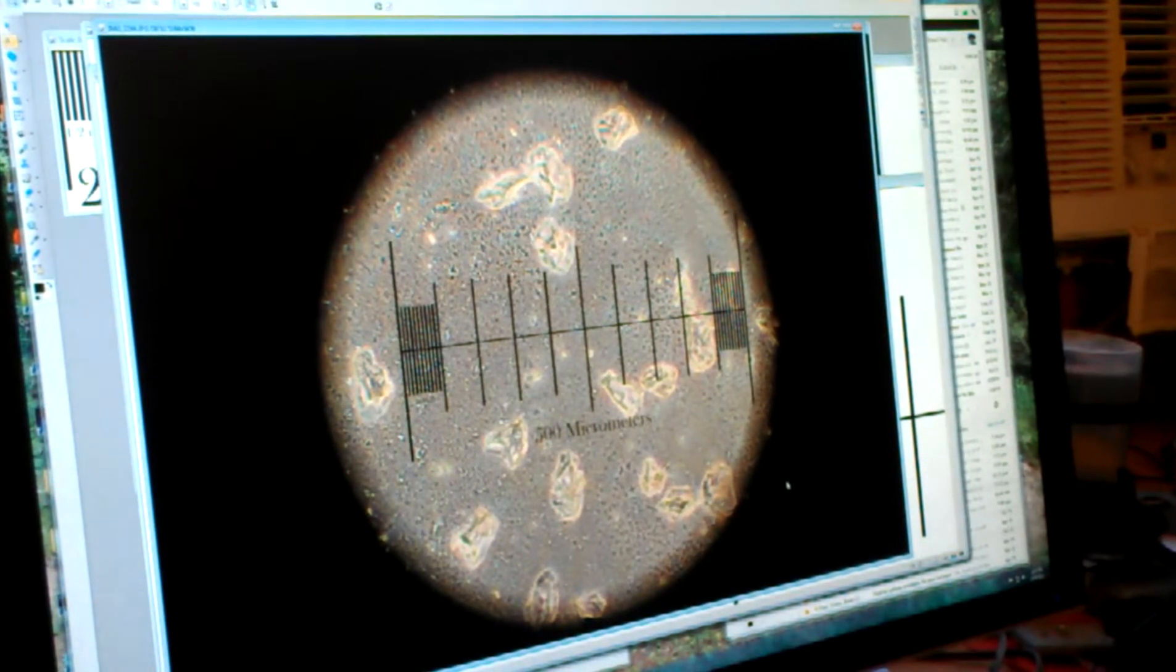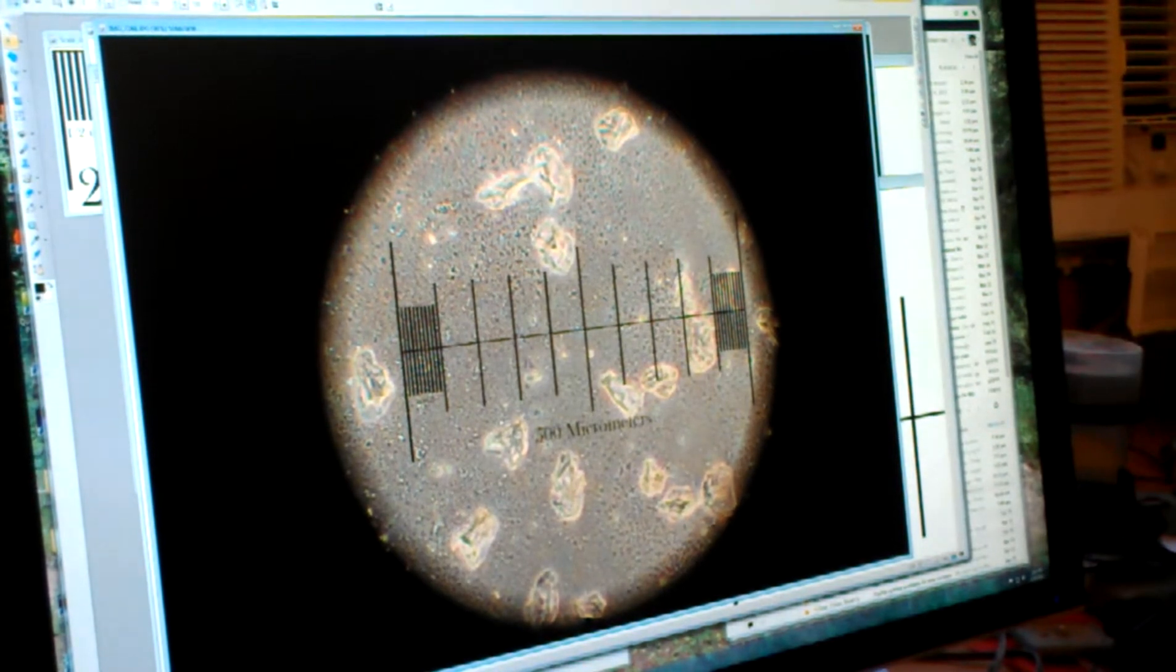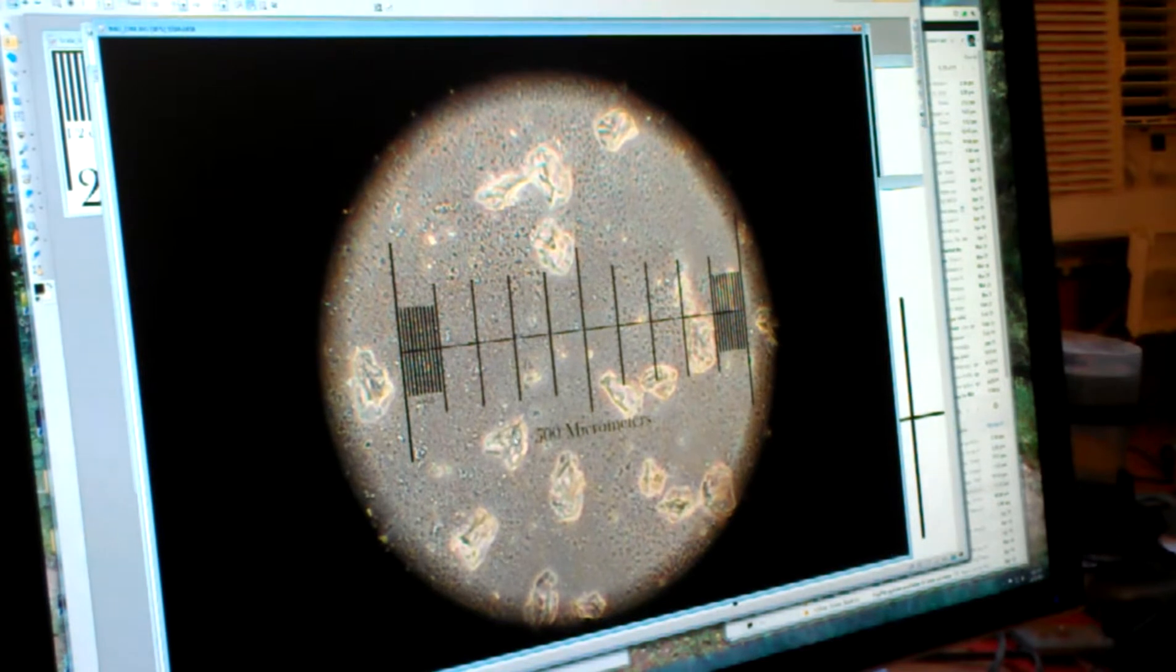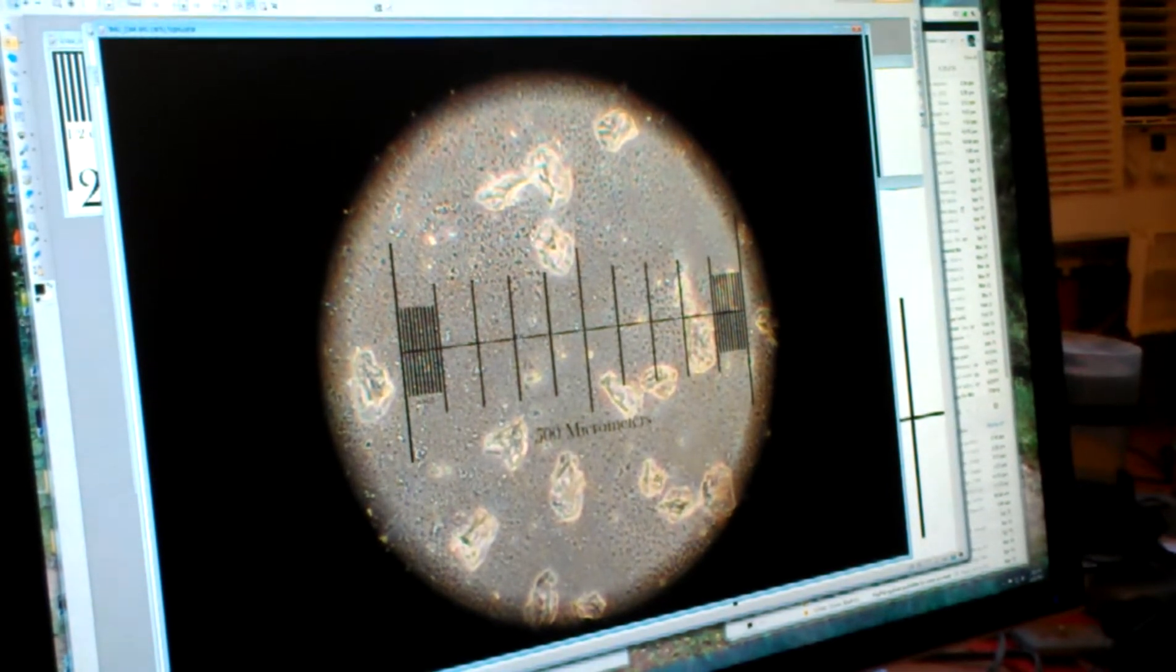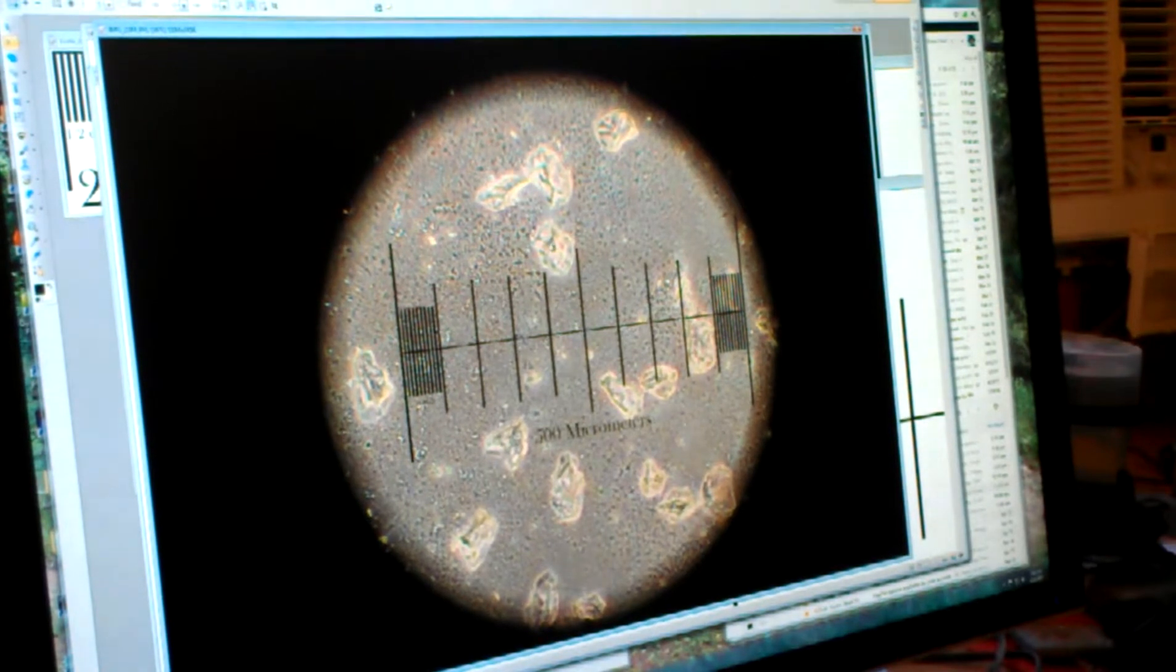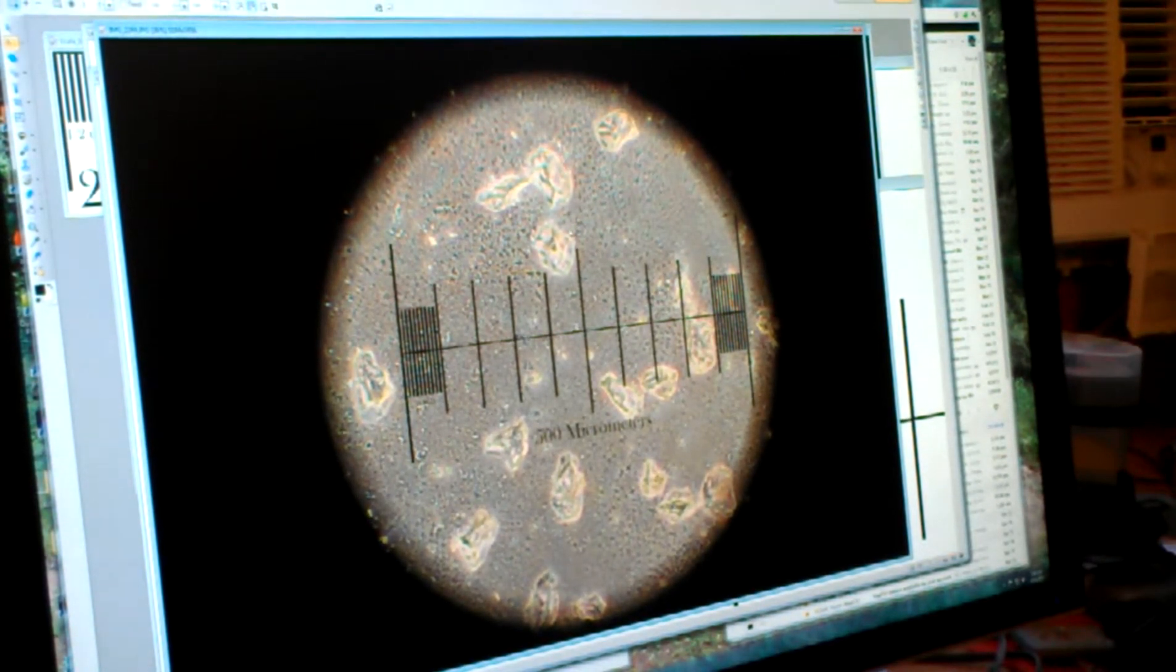In some of these, this is a phase contrast, so you can see a nucleus here. This over here, this is an unfocused nucleus. And so these are the epithelial cells.